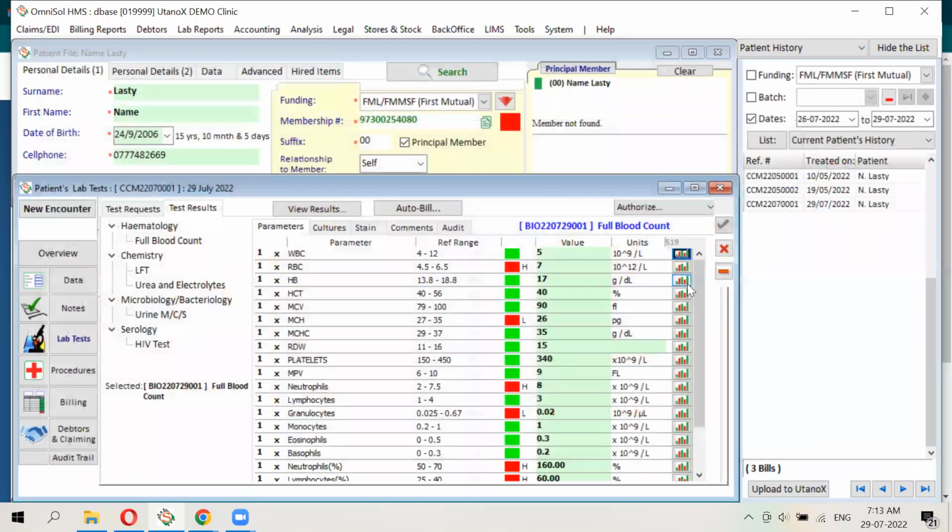Okay. So the graph can be sent separately, or it can be an attachment. Such that someone will receive a full blood count result with the current results plus the graphs showing how the changes in the RBC and WBCs were, for example. That is correct. So does it only show the immediate previous one, or how many previous ones does it show?